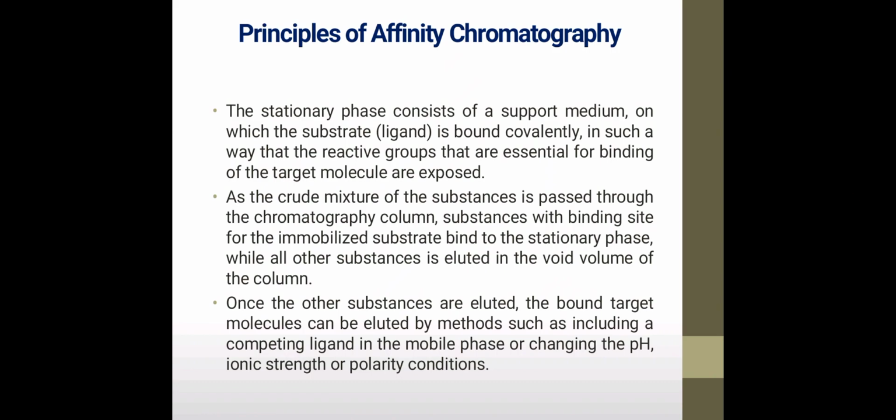Now let's see the principles of this affinity chromatography. The stationary phase consists of the supporting medium on which the substrate, that is the ligand, is bound covalently in such a way that the reactive groups that are essential for binding of the target molecules are exposed. So these ligands are very specific. In this ligand only the analyte in the mixture which passes through the mobile phase will bind.